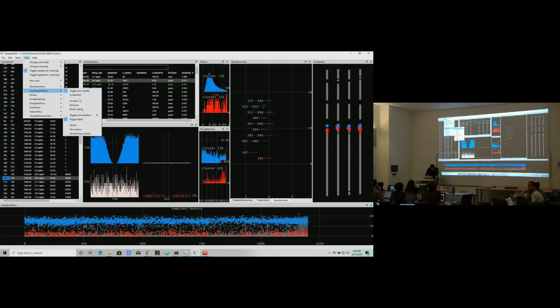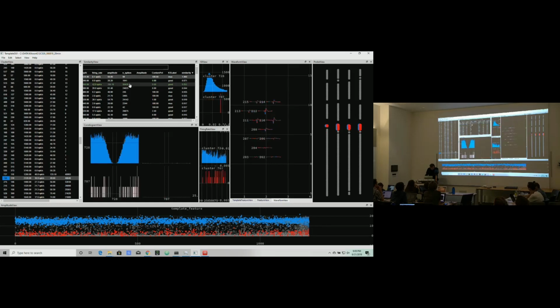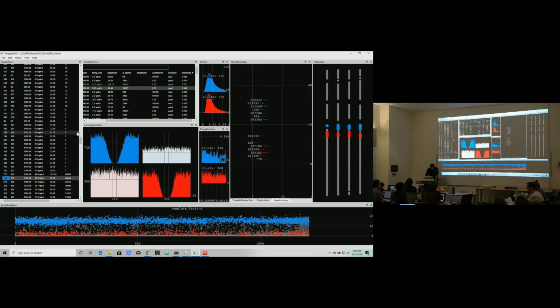Right? At the bottom, the amplitude for the spike is much lower sometimes. Where? The red one? This one here? Yeah. So what makes you think that makes it the same cell? Well, that's not the same cell, we know that much. Oh, the one you merged just went away. The one I merged went away. Oh, okay, sorry, I got confused. Yeah. Let's go back to the top of our list.